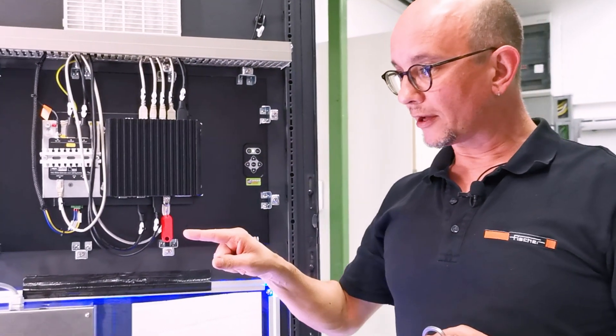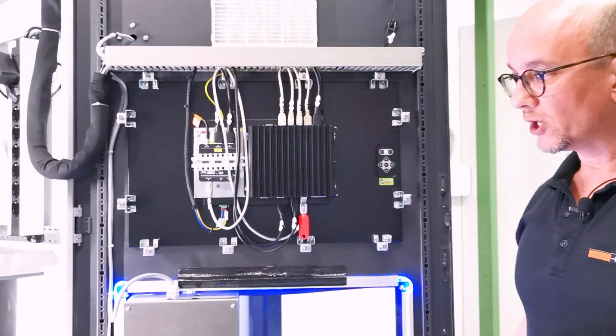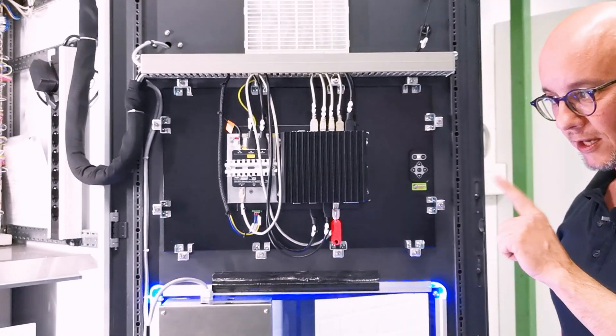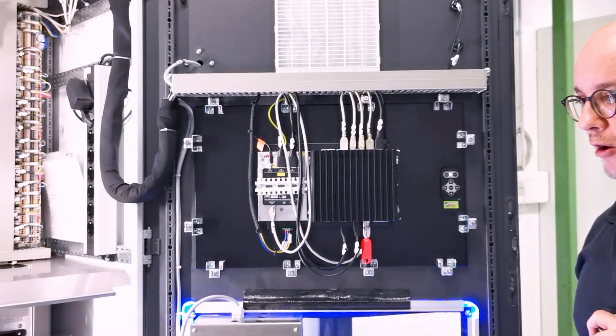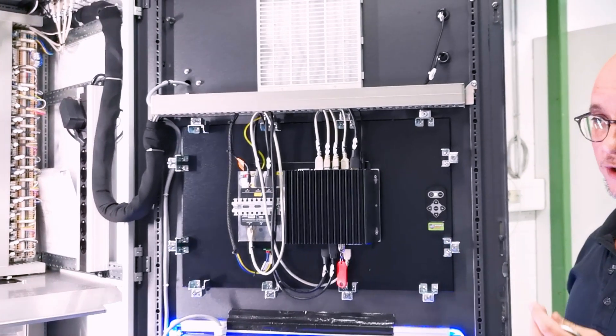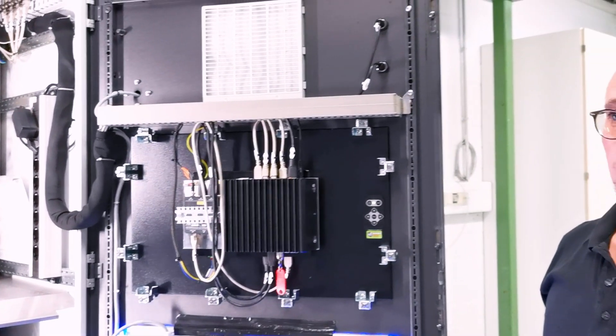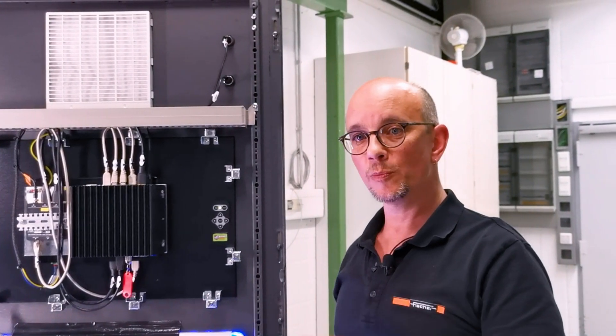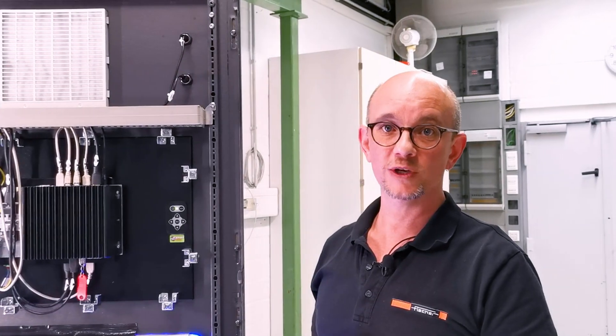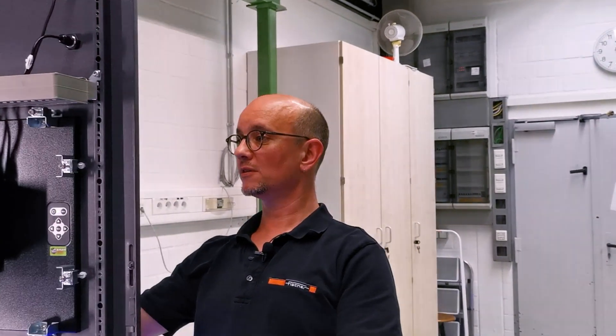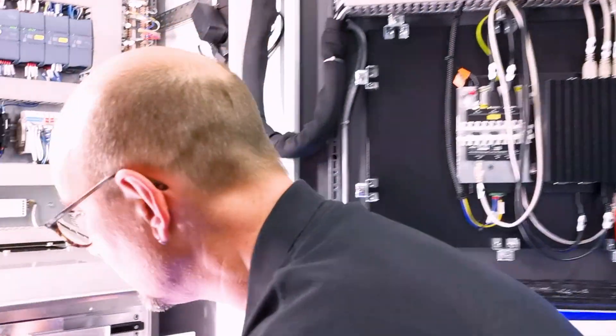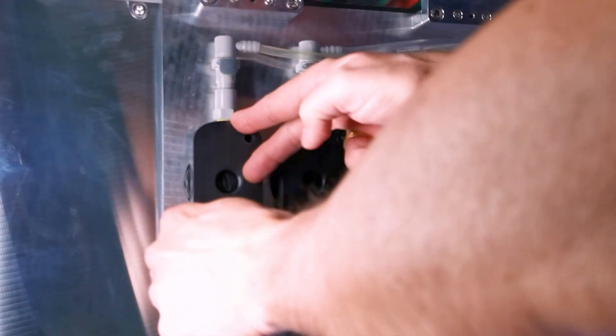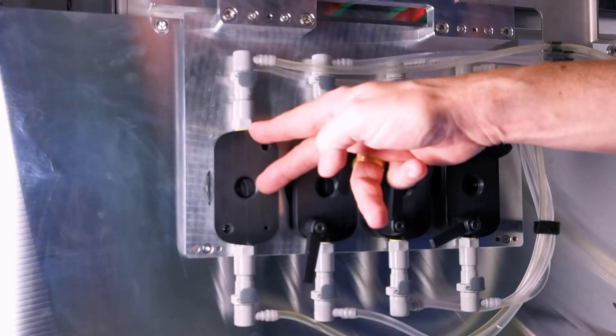I would now like to show you real quick the construction of the flow cell, which shall show you our focus on super easy maintainability and quick service times. For that, I am switching off the automatic mode and real quick unscrew the flow cell and show you the construction of it, which is done completely tool-free.